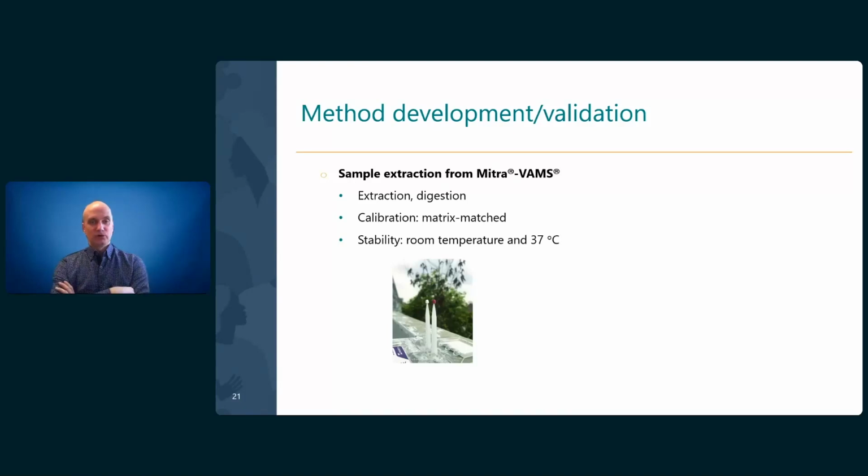Then we also checked the sample extraction process. We tested for extraction with different agents, but also digestion, and we figured out that digestion is the best way to recover most of the analytes with a good recovery, actually. We also tested different calibration approaches, and we figured out that matrix-matched calibration is the best approach, so we chose this one.